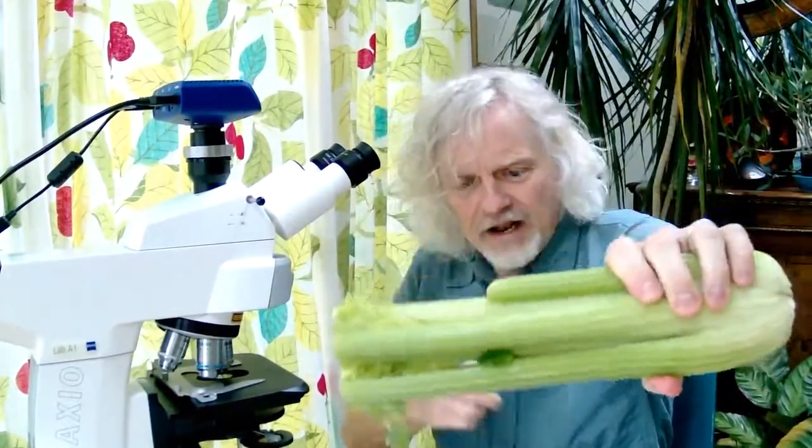Hello everyone, welcome to Micro Minute. My name is Marty Jopson and today, underneath my microscope, I will be placing some of this! Celery, although clearly not the whole celery bundle, but just a very, very tiny sliver of celery.